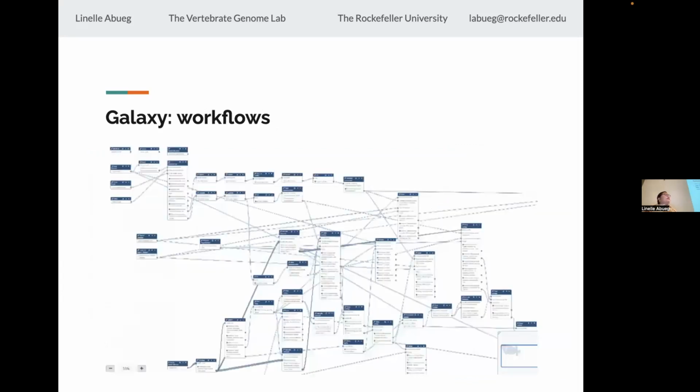The other key advantage of Galaxy is it helps make workflows a lot more reproducible, because you can package them up in workflows. This example is our HiFiasm workflow, I believe. You can see all the steps. If you're familiar with command line work, it's as if you took a bash script and made it into a flowchart, with the jobs leading to each other, inputs feeding in, and outputs feeding as inputs to different jobs. You can also select which outputs you want to keep or which ones you want to discard, which are temporary. All of this is what would be going on under the hood.